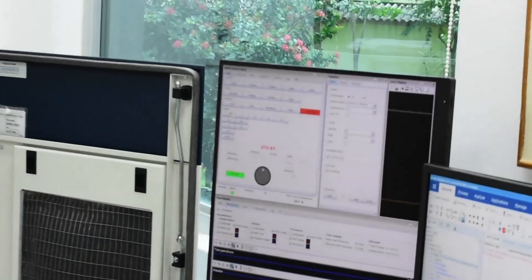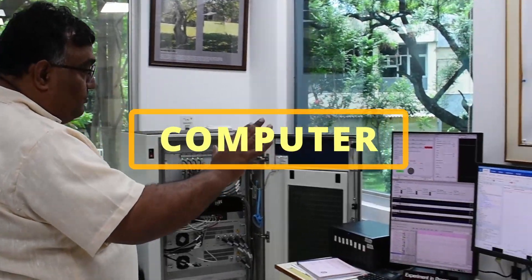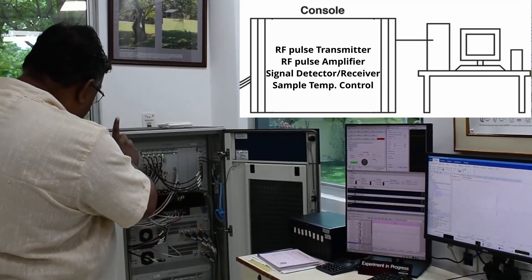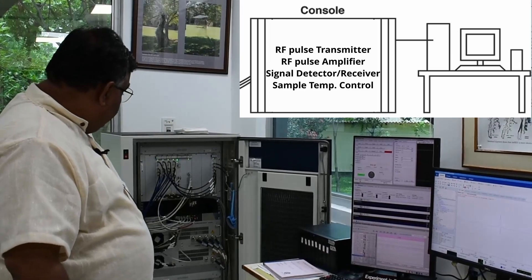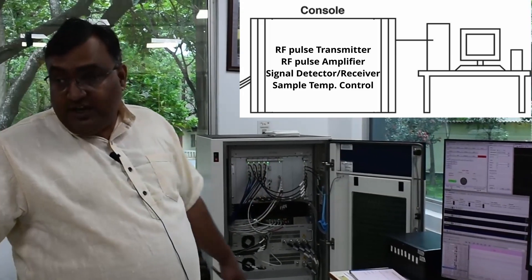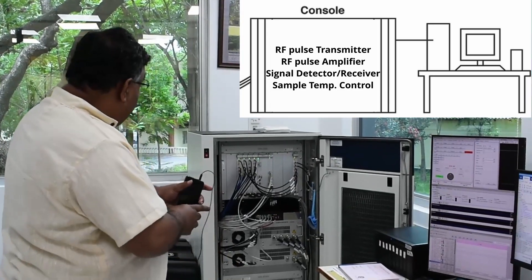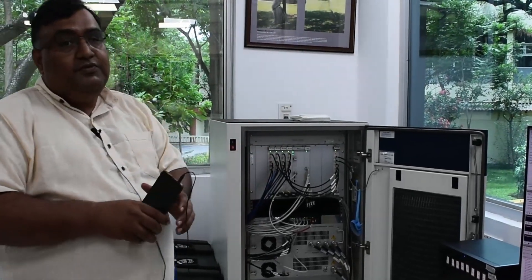So we have a magnet, we have a probe, and we have a console. Now the other component is this computer. This computer not only controls what radio frequency to be given, how it is to be given, how to control the shim systems, how to control the amplifiers, but it also controls the temperature of a sample. And that happens through a unit which previously used to be in the front, now it has gone in the backside. This is called as BVT. Now BVT's role is to ensure that your sample is at room temperature.